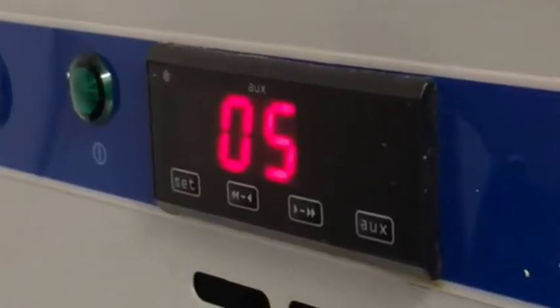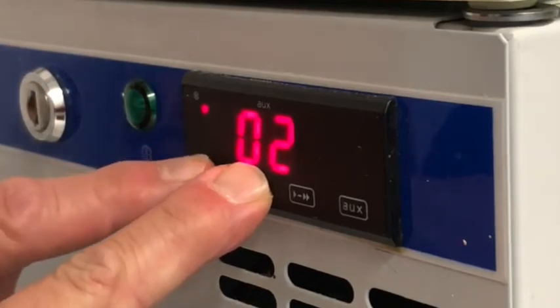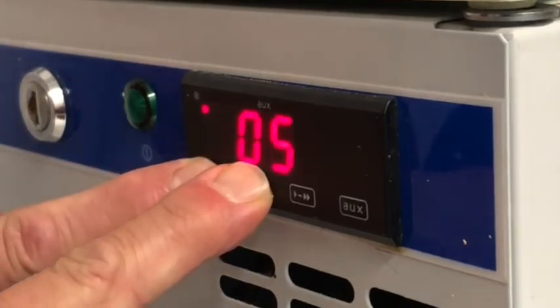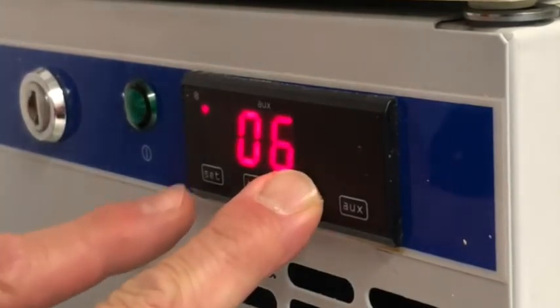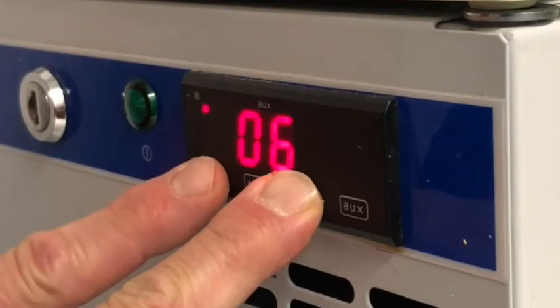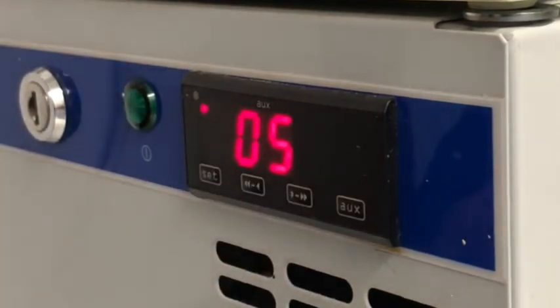For fridges with the second display type, press and hold the left arrow button to show the minimum temperature. Record this, then press the set button to reset the minimum temperature measurement. Then press and hold the right arrow button to show the maximum temperature. Record this, then press the set button to reset the maximum temperature measurement. You've now reset the maximum and minimum recorded temperatures.